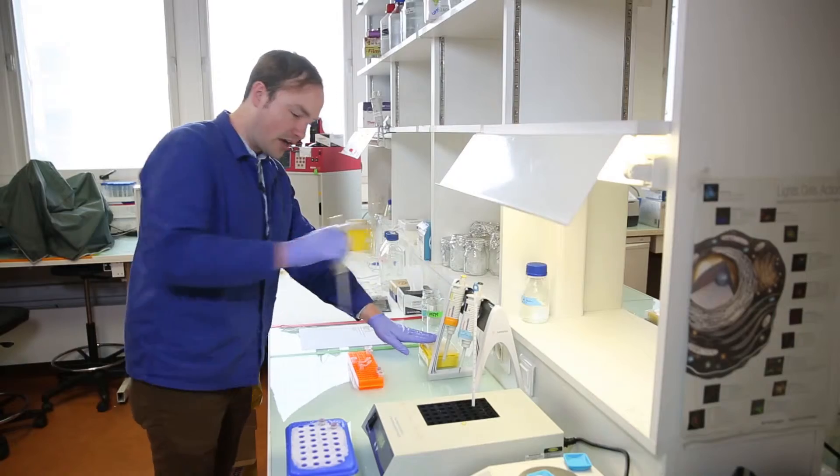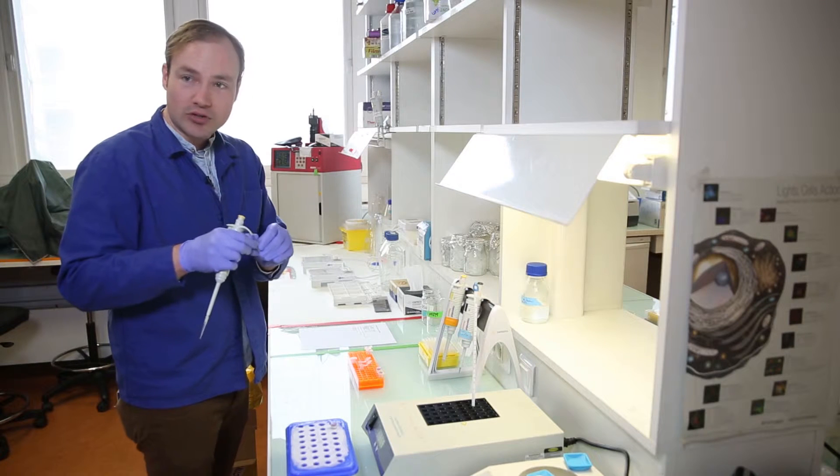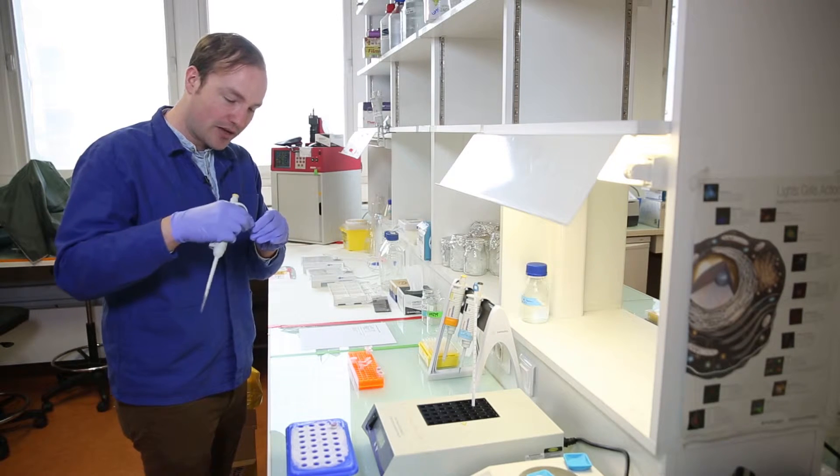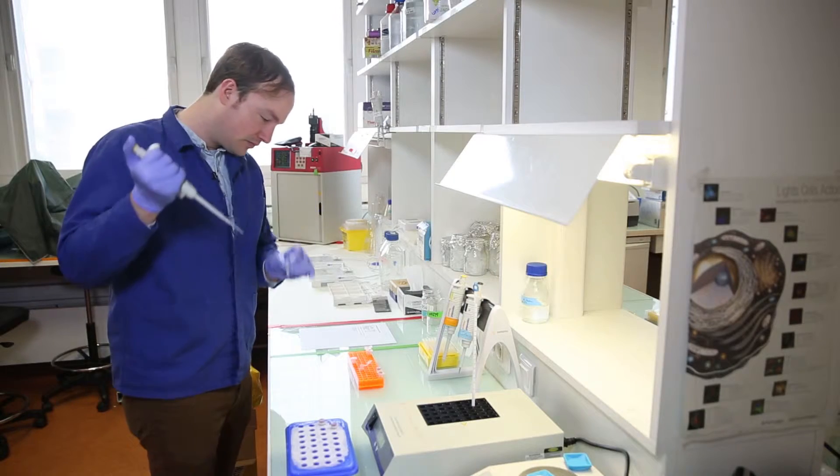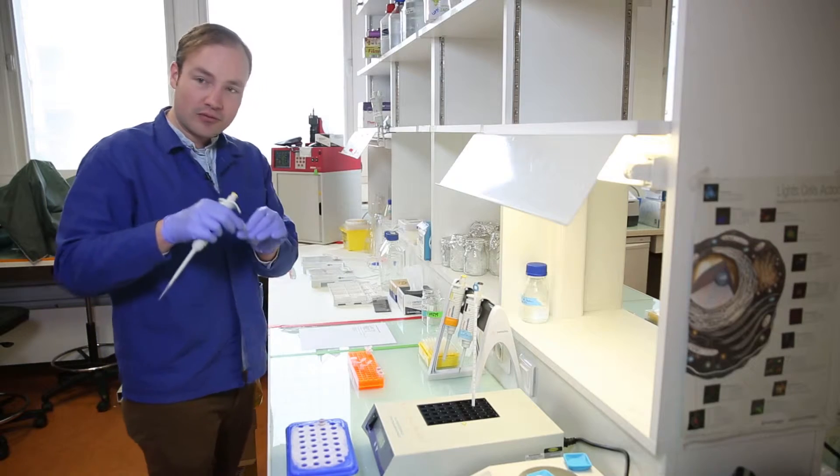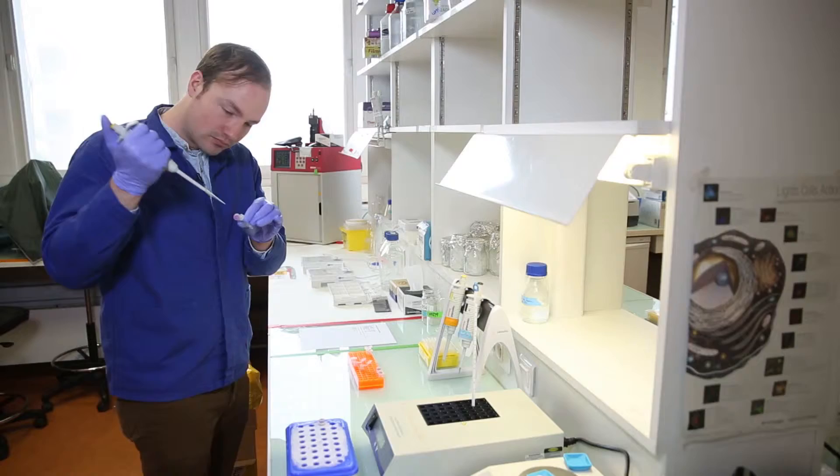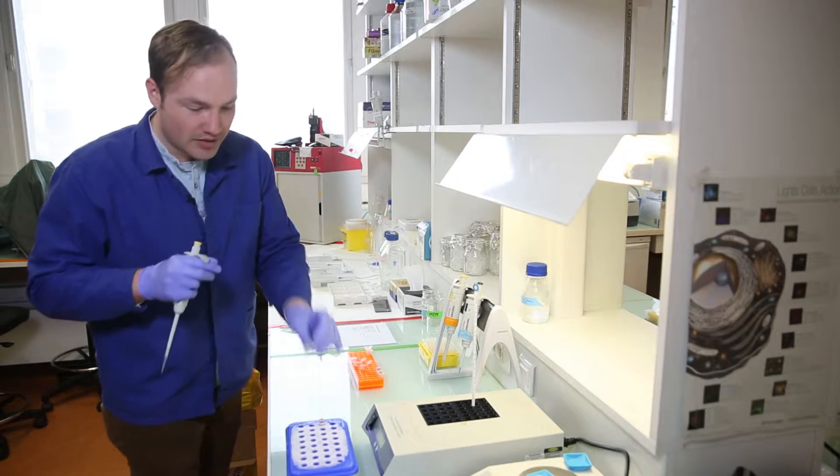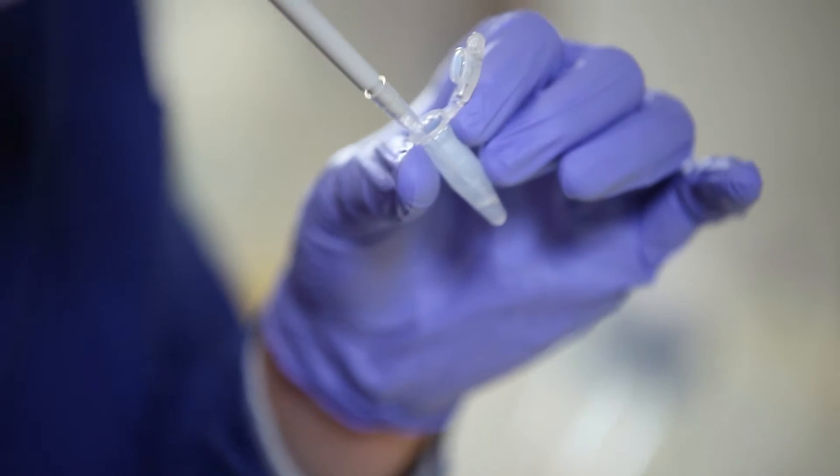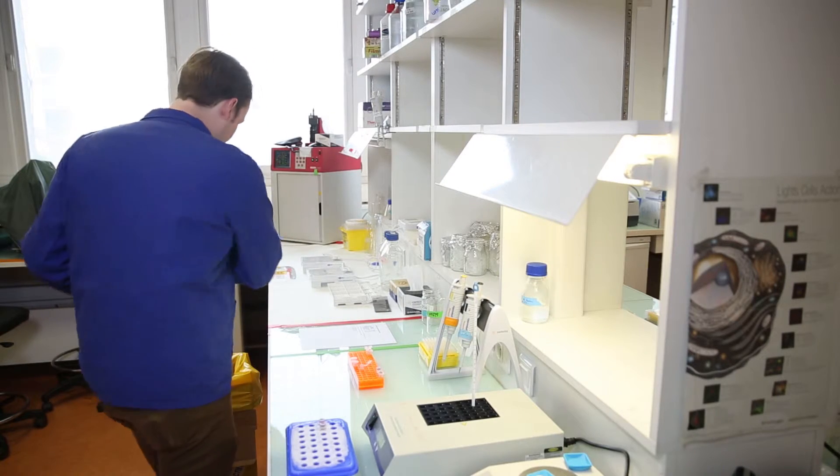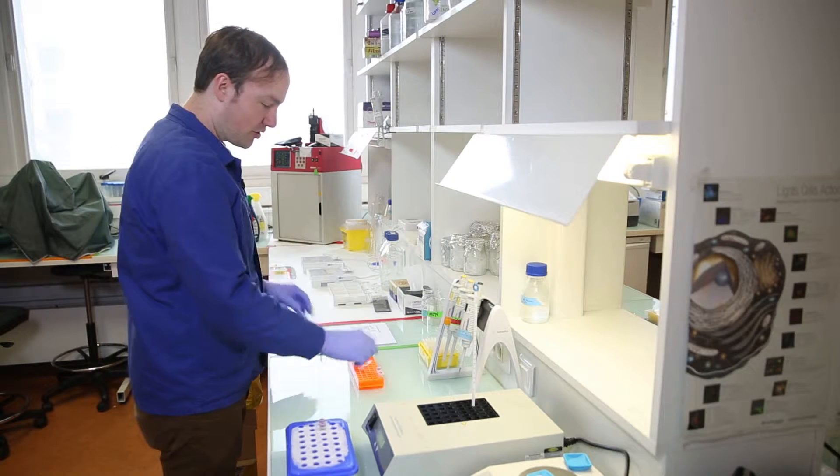The second reaction that I'm preparing will have two restriction enzymes. So again, four microliters of the first enzyme, just as before. Four microliters of the second enzyme. You'll notice that I'm changing my pipette tips after every operation so that I don't cross contaminate my enzymes.